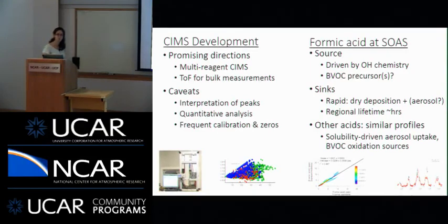How do you generate your zero air? We buy it. We buy the ultra-high purity zero air. If we generate the zero air, we have a very hard time making it cleaner than that, and we have a hard time keeping the pressure constant if we have a real-time zero air generator.